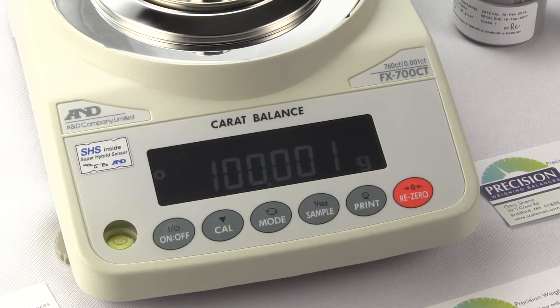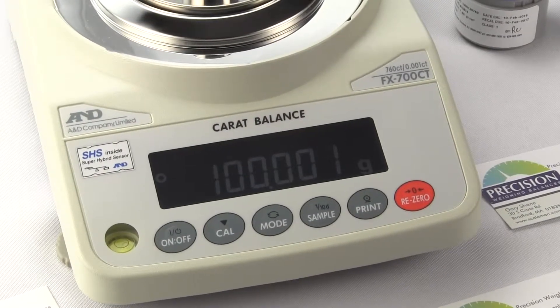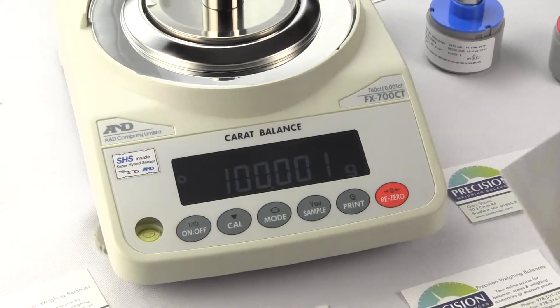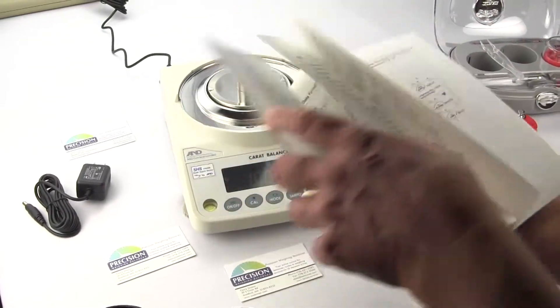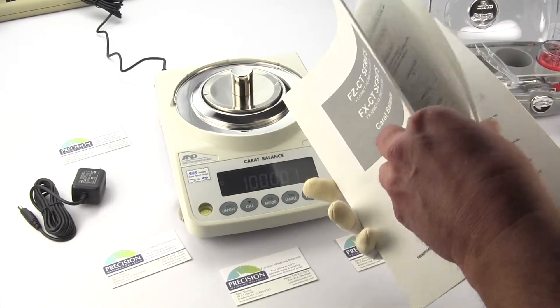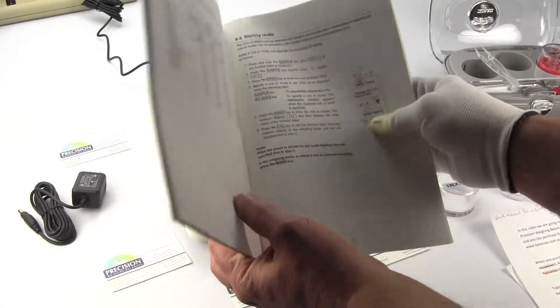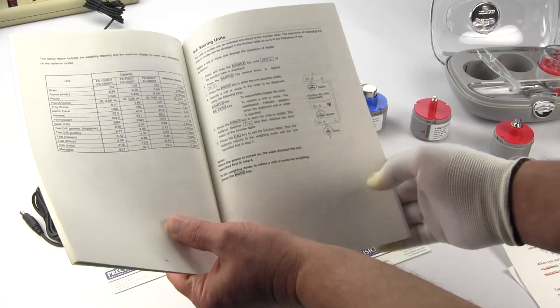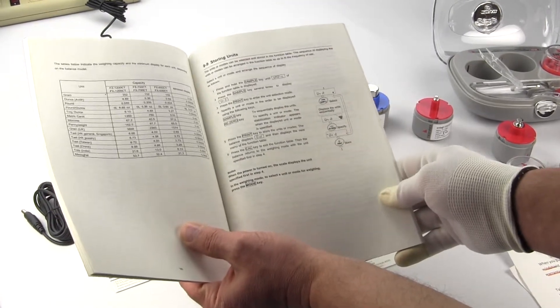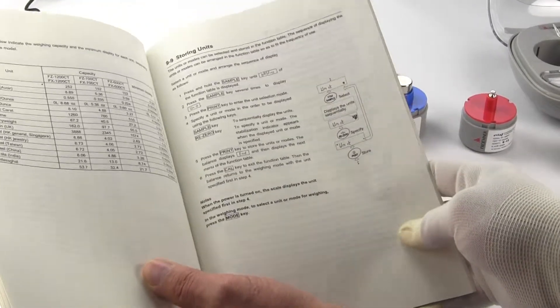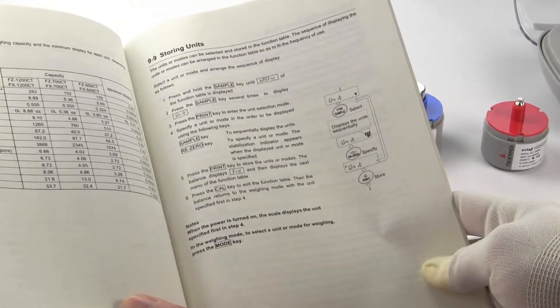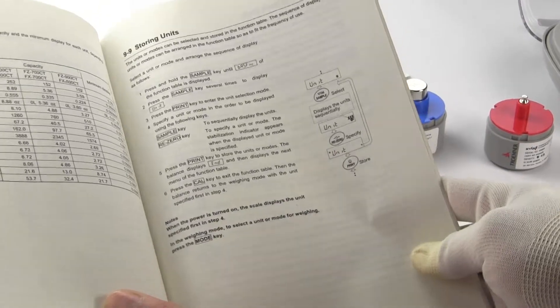The manual again will explain in clear details how to configure these weigh units. So in the manual on page 37 it gives you step-by-step instructions here on how to store multiple weigh units. The point I'm just trying to address is A&D offers a well-documented manual that most people can easily follow.